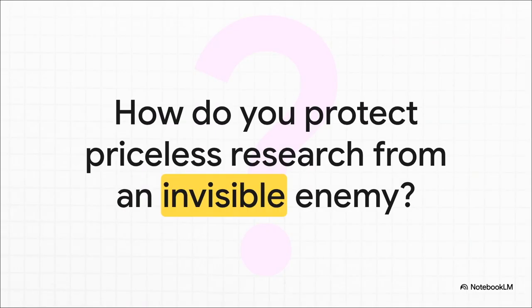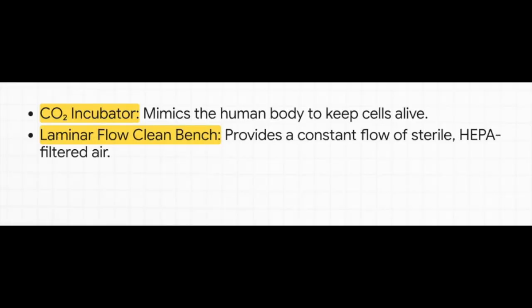There are many parts of a cell culture space that need to be thoroughly cleaned regularly, routinely, and especially when there's contamination. You have your incubator, you may also have a water bath, you may have a clean bench, or more suitably for culturing any kind of mammalian or human cell culture, a biosafety cabinet.